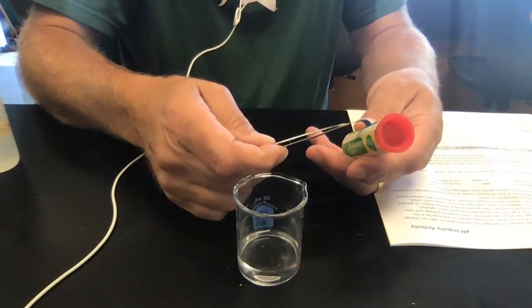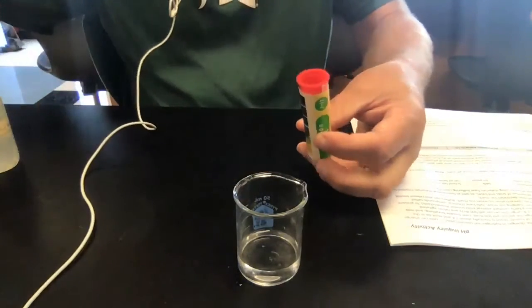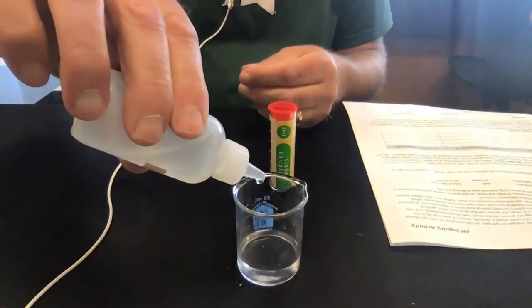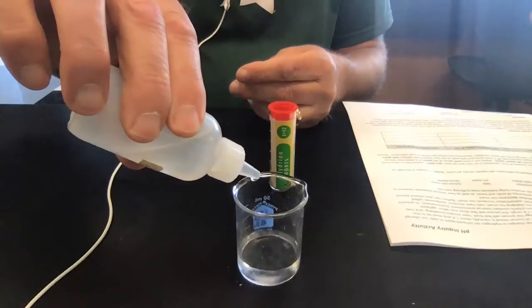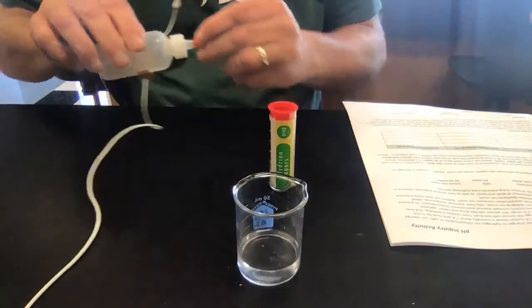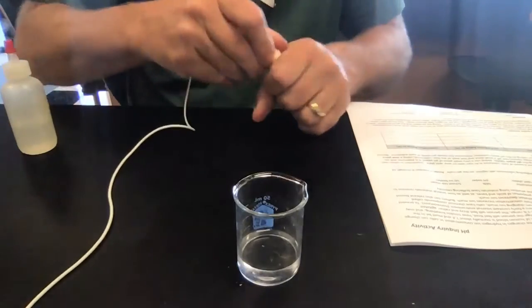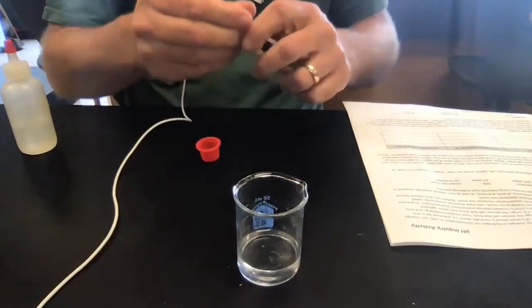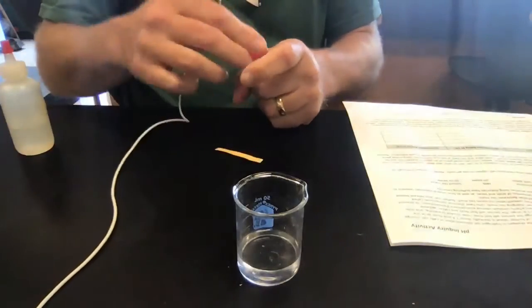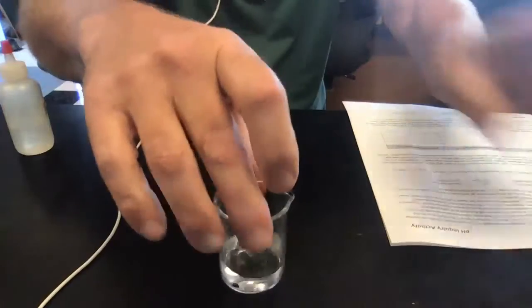And I'll call that a pH of 10. Add 10 more drops. And I got to get some more pH paper out. Swirl that around.